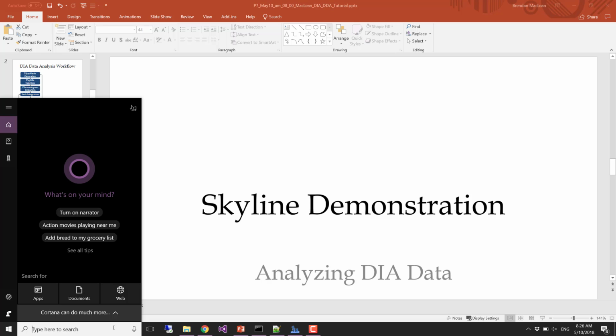We've spent the last year looking for this modification, and then you look at the MS2s, and you're like, that didn't actually exist. He used a database, but that wasn't very good. And I'm feeling a little unconfident about how to look at MS2s in this DIA world. Yeah, you won't typically look at MS2s in the same way that you look at DDA MS2s, but you will definitely be able to build up the same kind of knowledge.